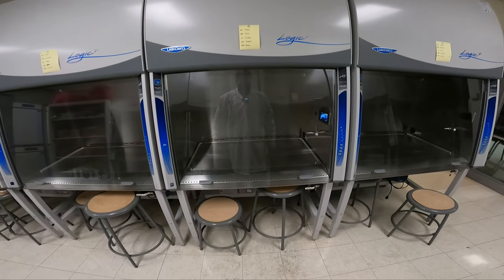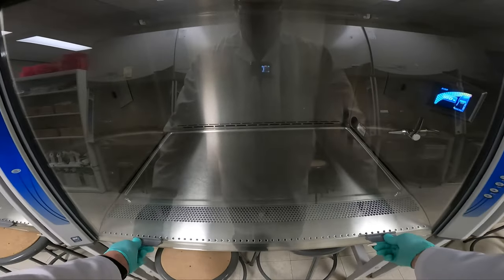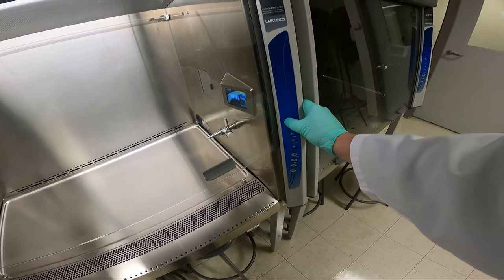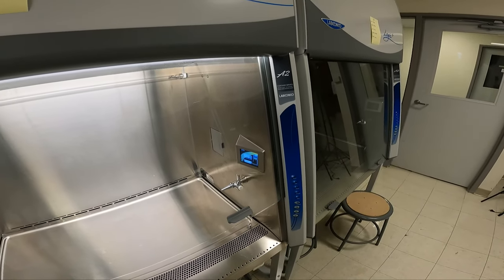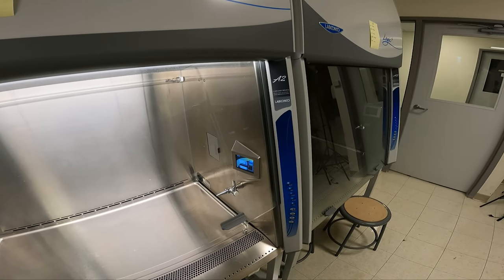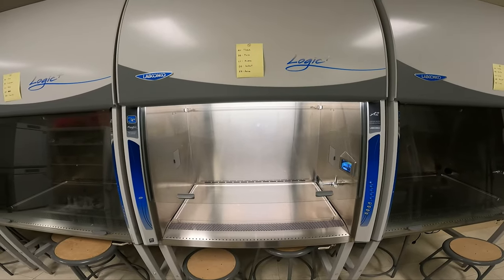First thing we need to do is open the sash. If you look at the left side, there's a little dot that says sash height. We raise it up to that height right there — the light will come on. On the right side, we have a button that says blower. We press that, and the little symbol says 'please wait' on the screen. This tells us the blower is starting up and not to start any activities until that symbol is gone.